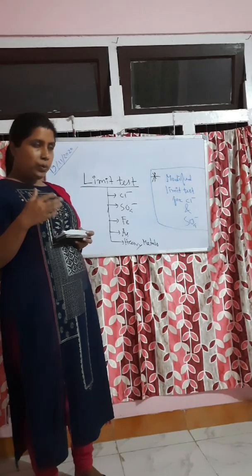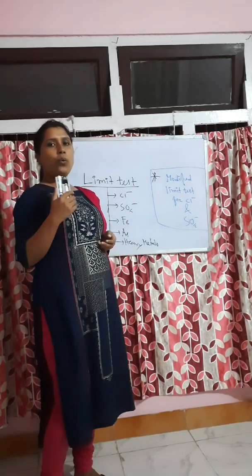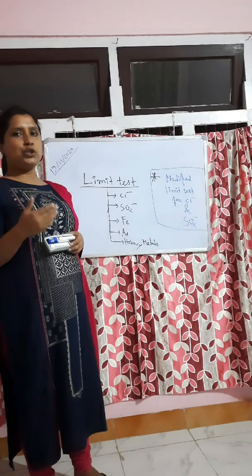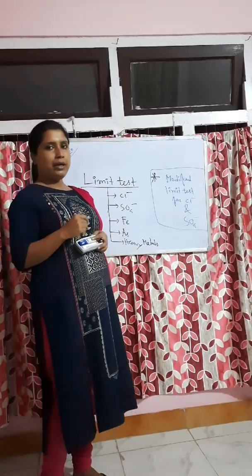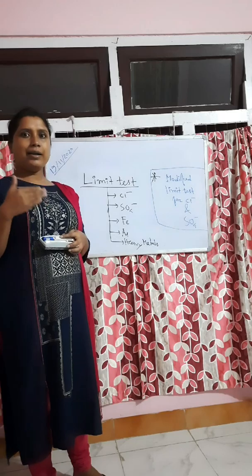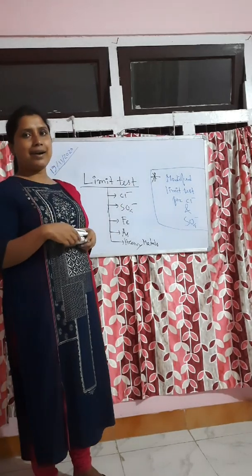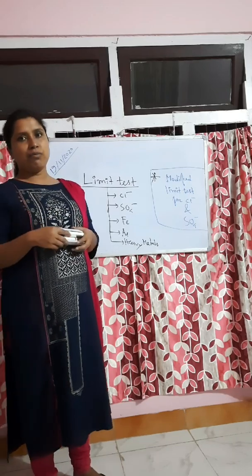Always when we are doing limit tests, we have to compare our test solution with a standard. I told you in the official book, that means pharmacopoeia, the limits of the tests are given, and how to do these limit tests is given.